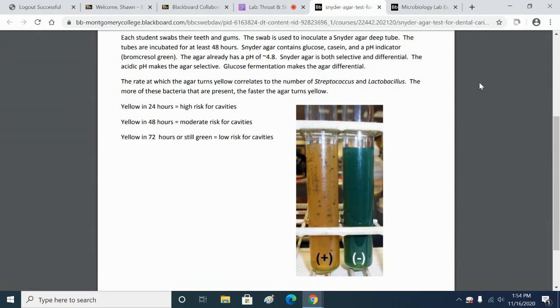The agar was cracked and broken, so what was happening? Does that indicate like CO2? Well, gas production, right? We can't be sure if it's CO2, but it definitely was producing gas. I've only ever seen that once, and that was not a good result: a bright yellow in 24 hours plus a lot of gas formation by those bacteria. So yeah, that wasn't very good.